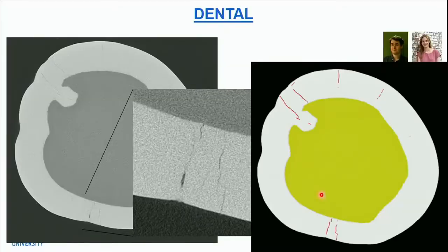blind thing where your opinion as an operator is in a sense not meaningful, because segmentation, purely grayscale segmentation, was of course impossible in these samples. So we did this machine learning with Dragonfly to identify the cracks. We tried it on a few samples already, but now we want to start the real study itself.